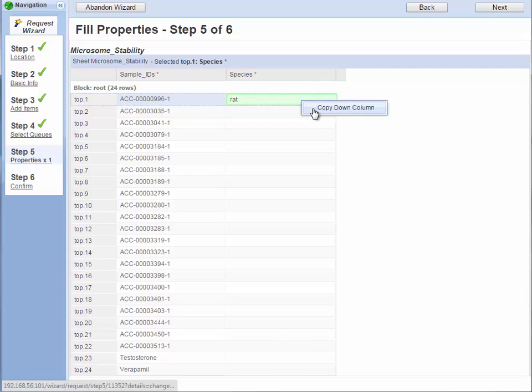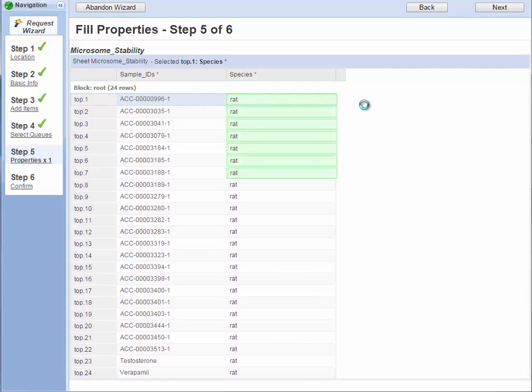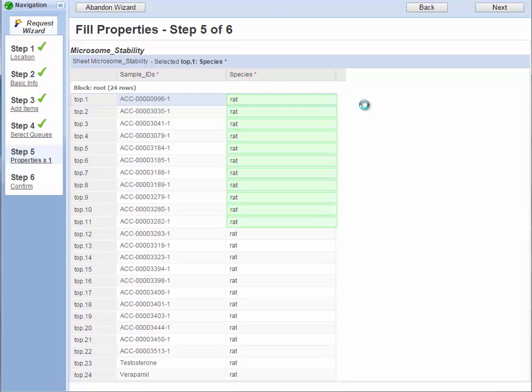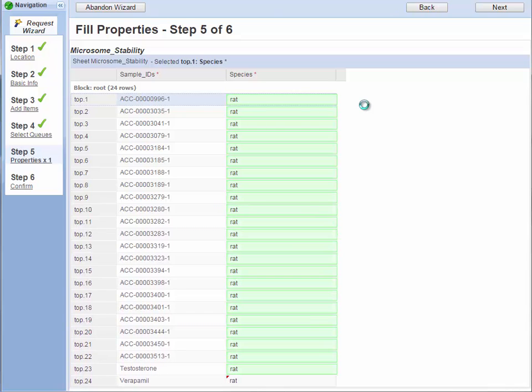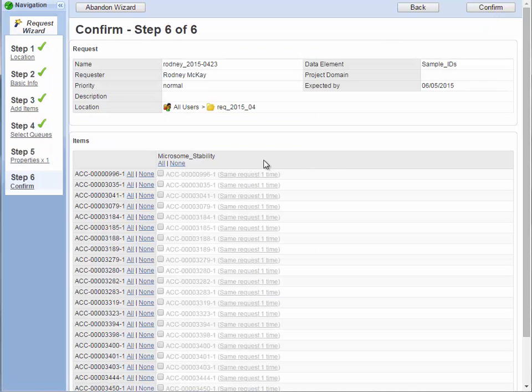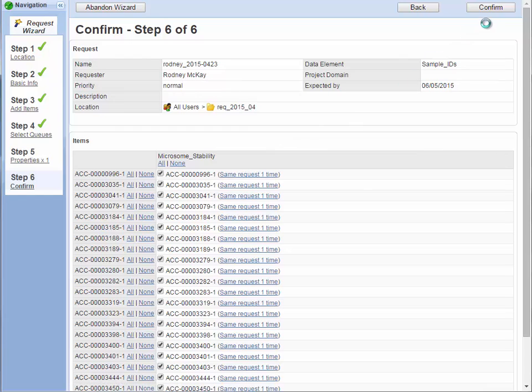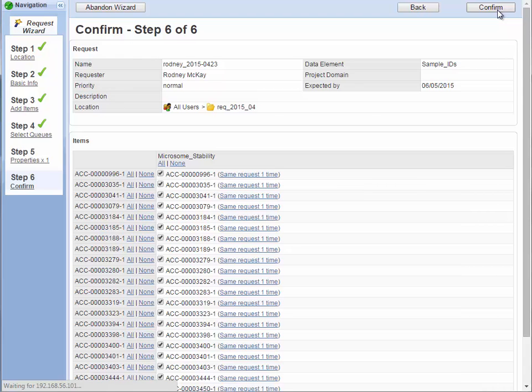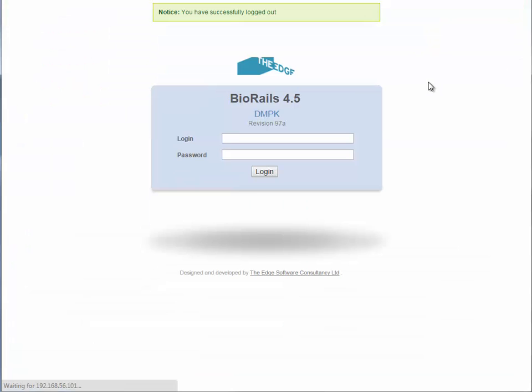In this case, I'm setting rat microsomes for the whole assay. Repeats are automatically deselected but you can select them to run again. Now that the request is complete, I can sign out as Rodney McKay.